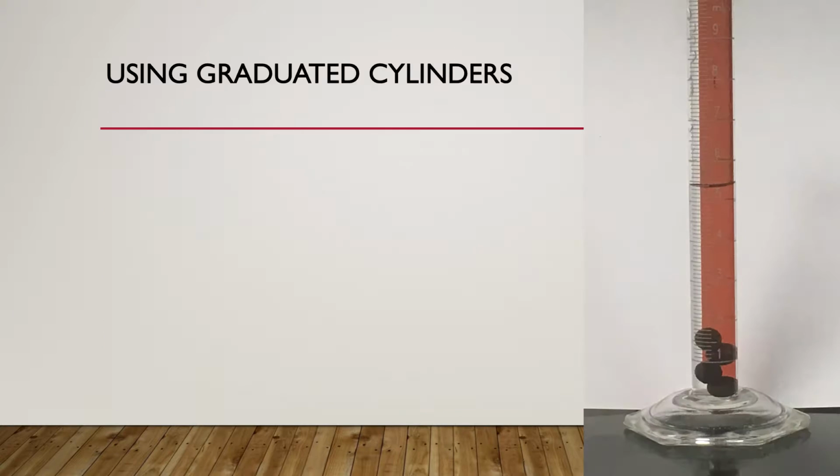All right. Now, the other way we're going to go about looking at volume, and this is the way we'll do it much more often throughout the semester, is using graduated cylinders. So, some general things to be aware of: usually graduated cylinders involve measuring liquids, and so we're almost always going to be using water or some sort of solution that is mostly water.